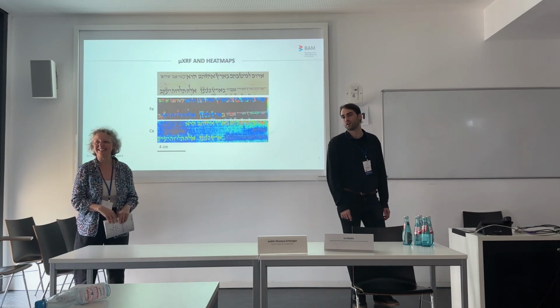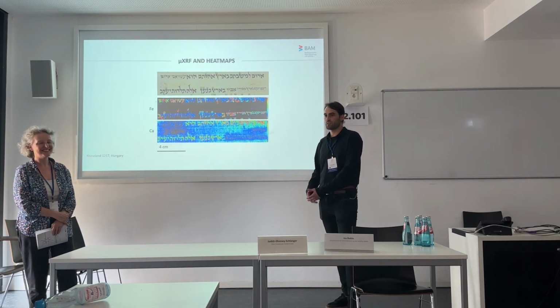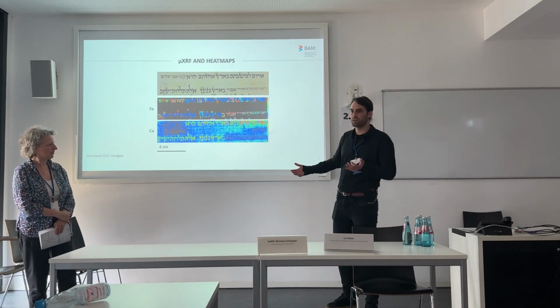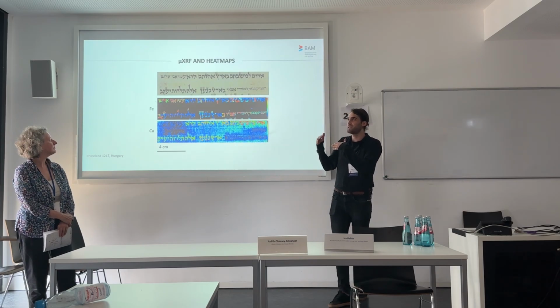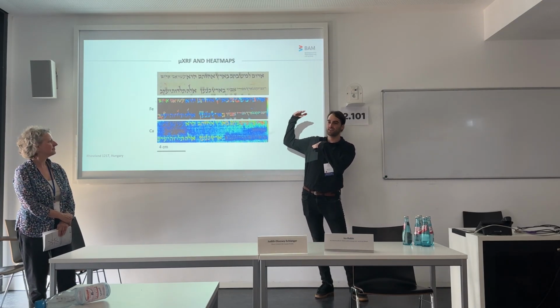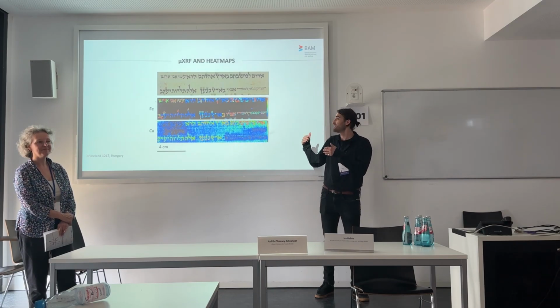Mark, why is heat map called heat map? Or maybe you said, I missed it. It's just the term you use when displaying any kind of data where you use a different color scale. Heat maps are for color scales where the higher the content, the abundance of whatever you're presenting, or the number, the color is warmer. Simply.